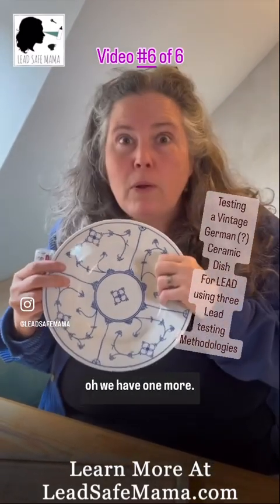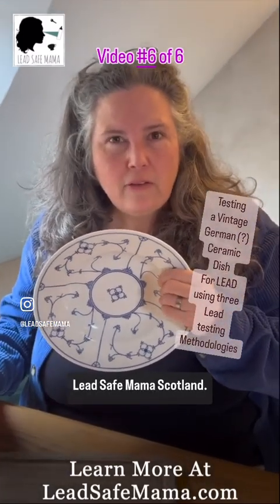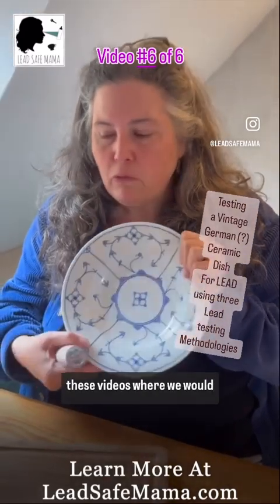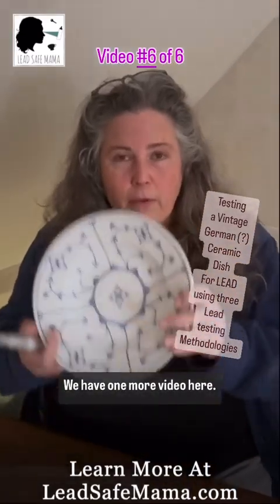We have one more test to show, so hold on one second. Look for these videos under the hashtag LeadSafeMamaScotland. You'll be able to find all these videos where we compare the XRF test results to the reactive agent home test kit results. We have one more video here.